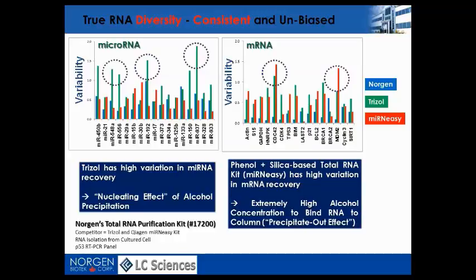So this is very important. Imagine you are isolating RNA from plasma and you mainly are isolating these small RNA and you can't find it. New forms of biological inputs such as extracellular RNA have new requirements for RNA isolation. Low quantity per volume, in our case from plasma, serum, urine, which have very low amounts of RNA. Also, the small size of the RNA species that we are isolating.